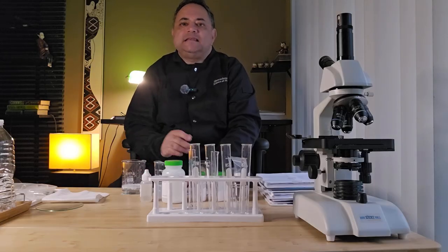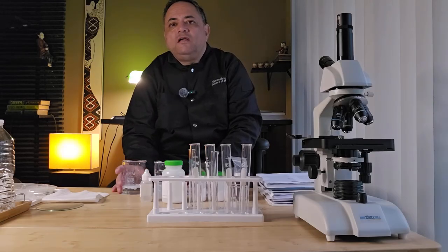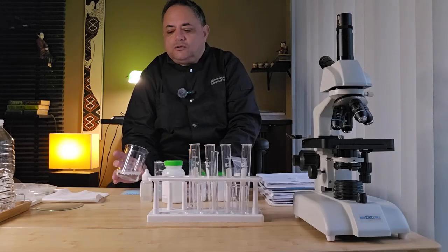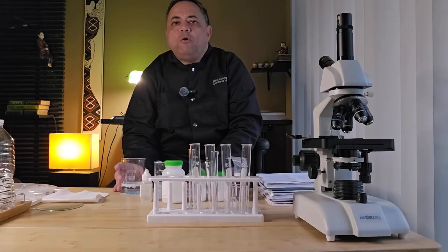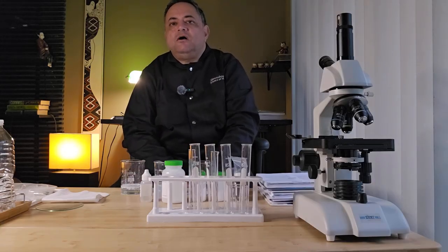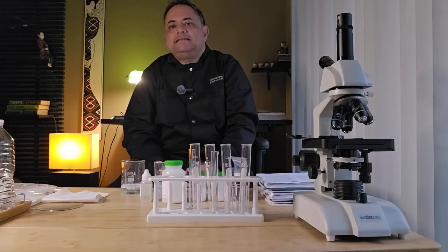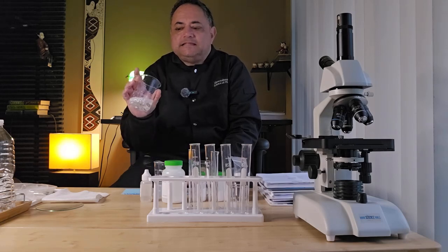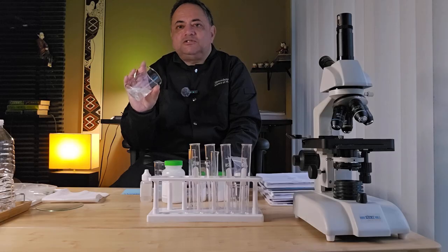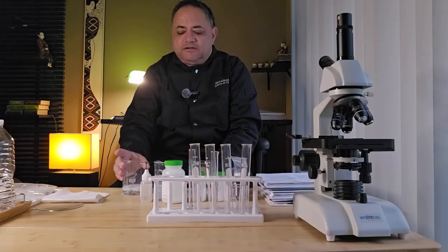What do we mean by a saturated solution? Basically, it's where you keep adding the chemical to your water until no more dissolves, because the water is so saturated with the compound that no more of that compound can dissolve. So it just remains in solid form in the solution. So I made my calcium acetate solution, and I've still got some solid in solution, so I know my solution is saturated.